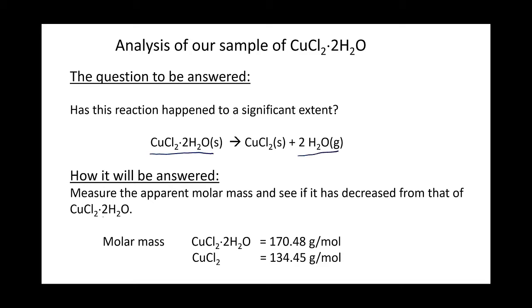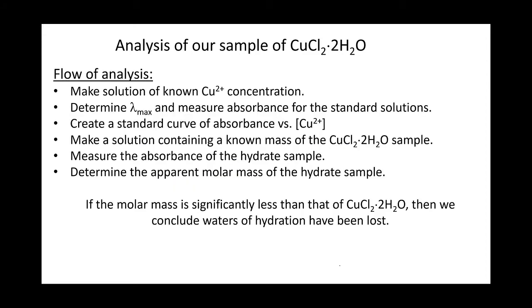And the way we'll answer it is by measuring the apparent molar mass of the sample, and from that we'll compare it to the known molar masses of the hydrate and the anhydrous and see if it's changed much. The pathway to get there is this.